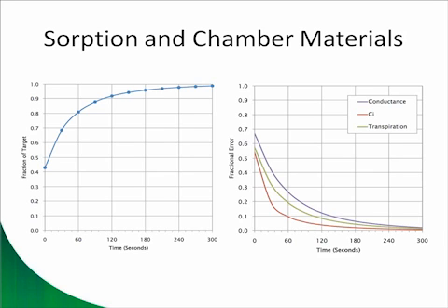This sorption effect on the fluxes is basically the same as our earlier example looking at the stabilization of CO2 concentrations. Just like with calculating a photosynthetic rate in the CO2 example, the error induced in transpiration here scales 1-to-1 with the curve shown in blue.